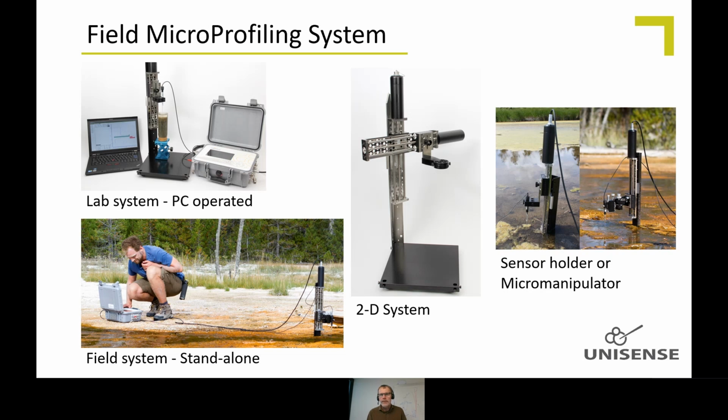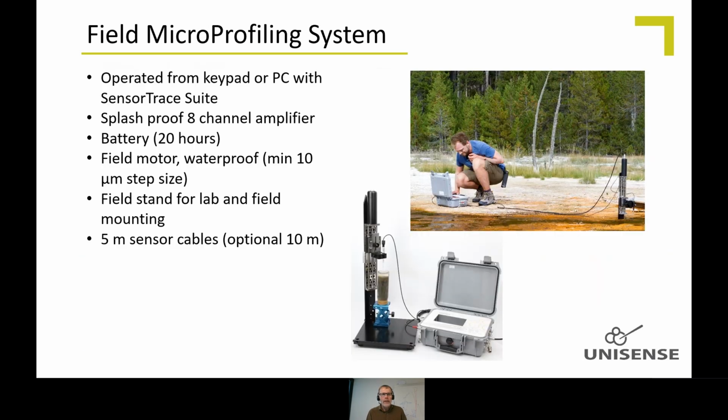So a very handy system for this. Just some details, I think I mentioned most of it. The battery has power for about 20 hours at 25 degrees centigrade.